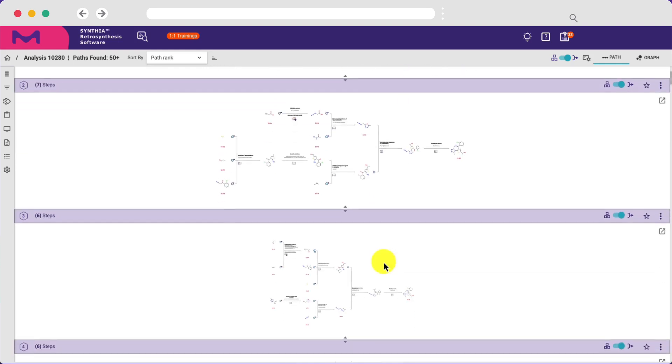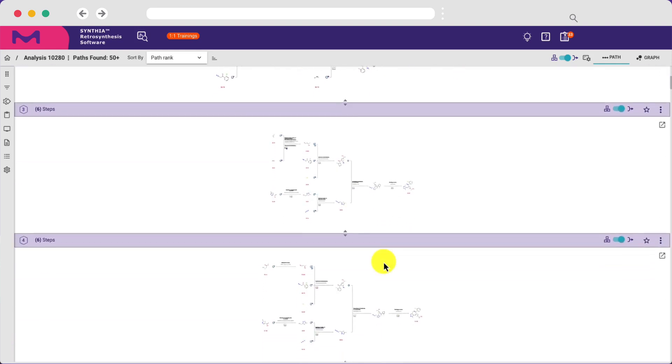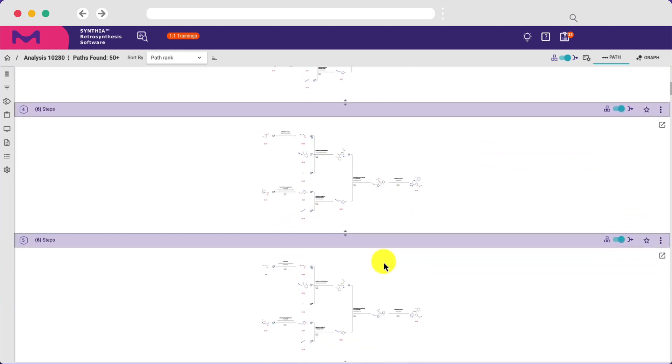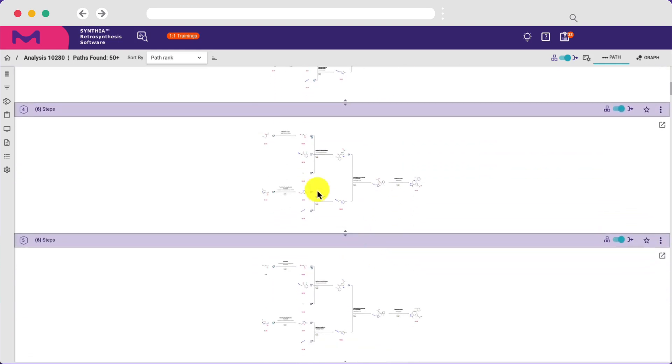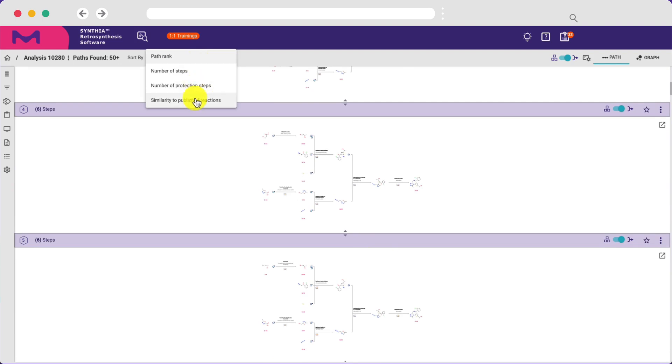When the results are in, you can navigate numerous potential synthetic pathways and sort based on path ranking, number of steps, whether protecting groups are required, or by similarity to published reactions.